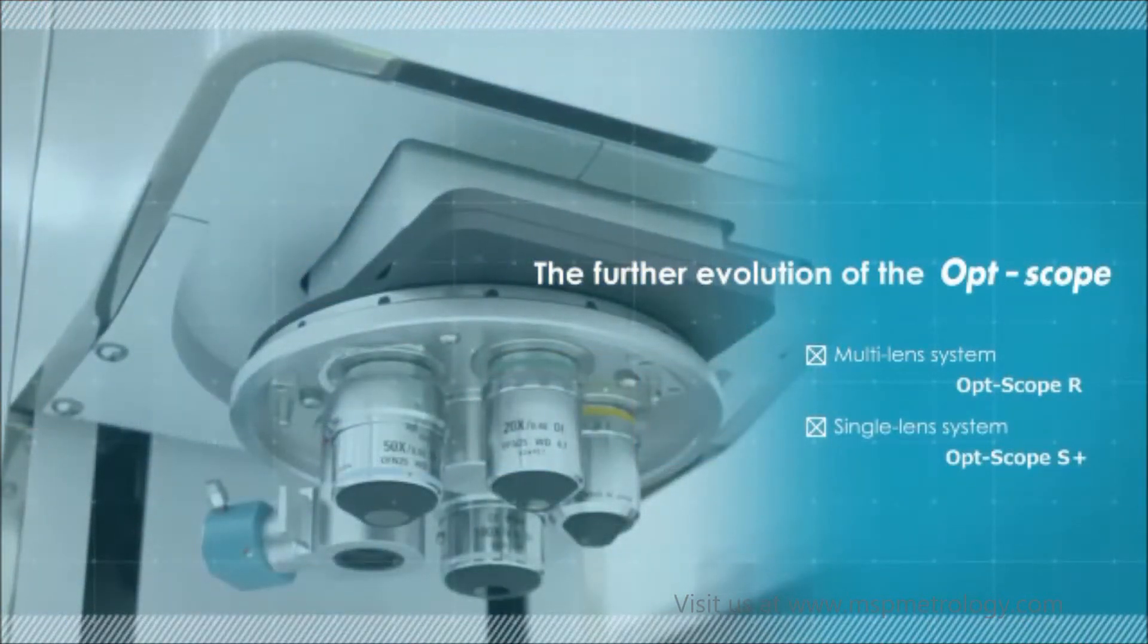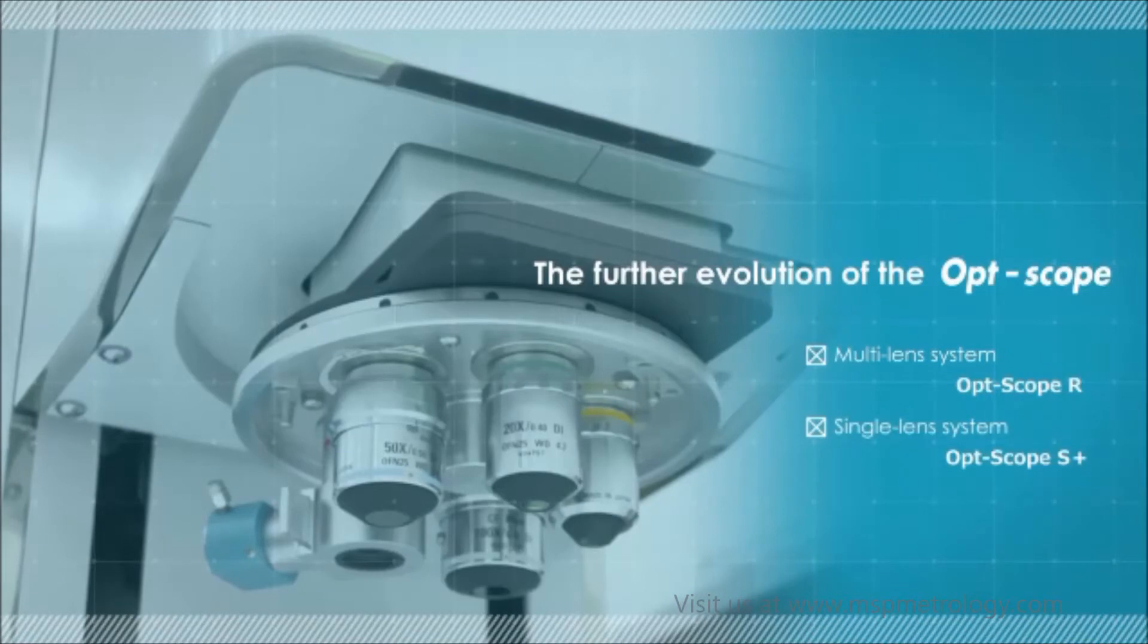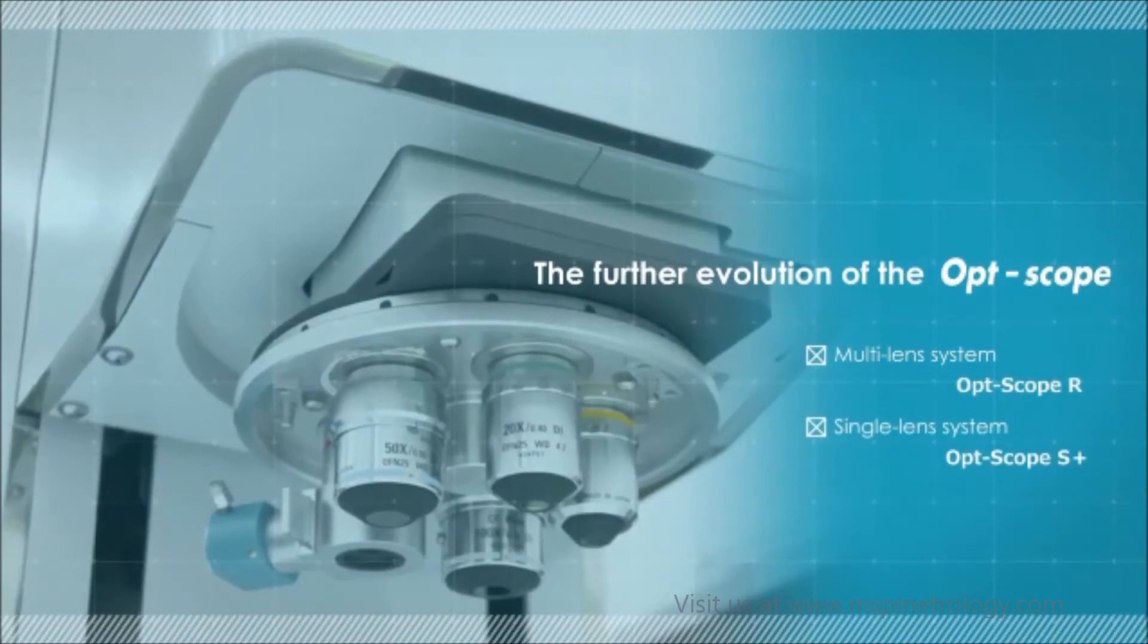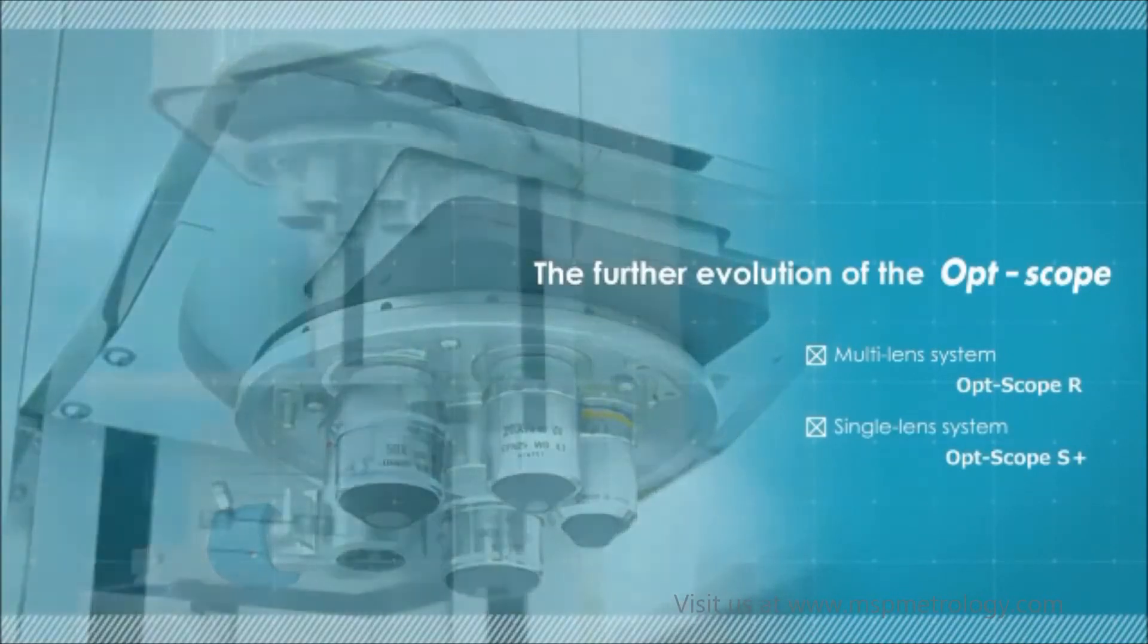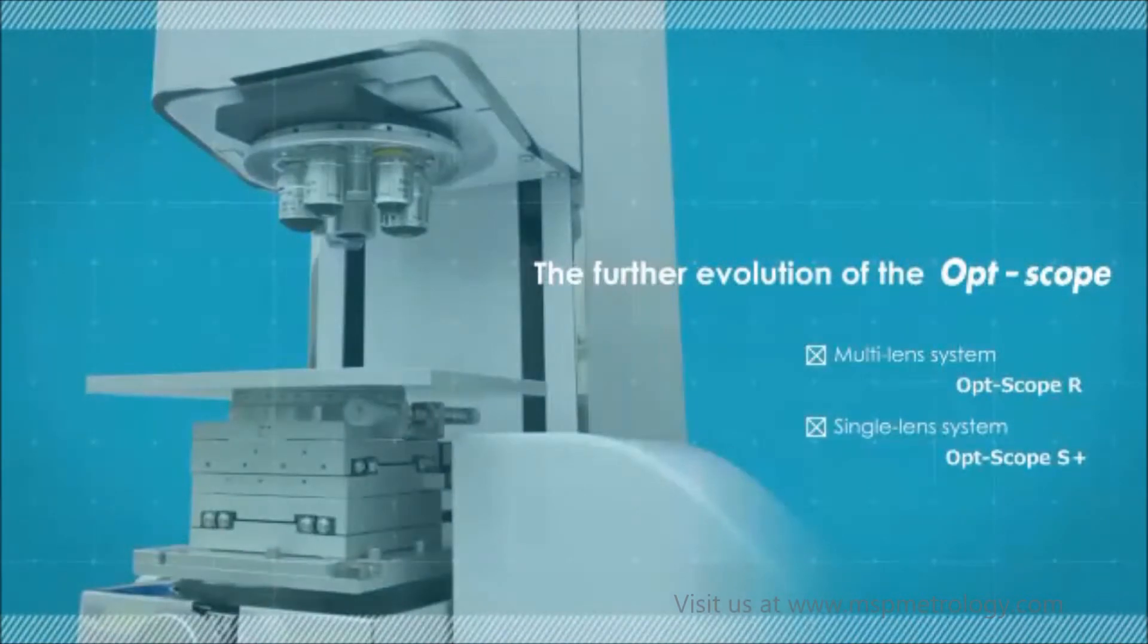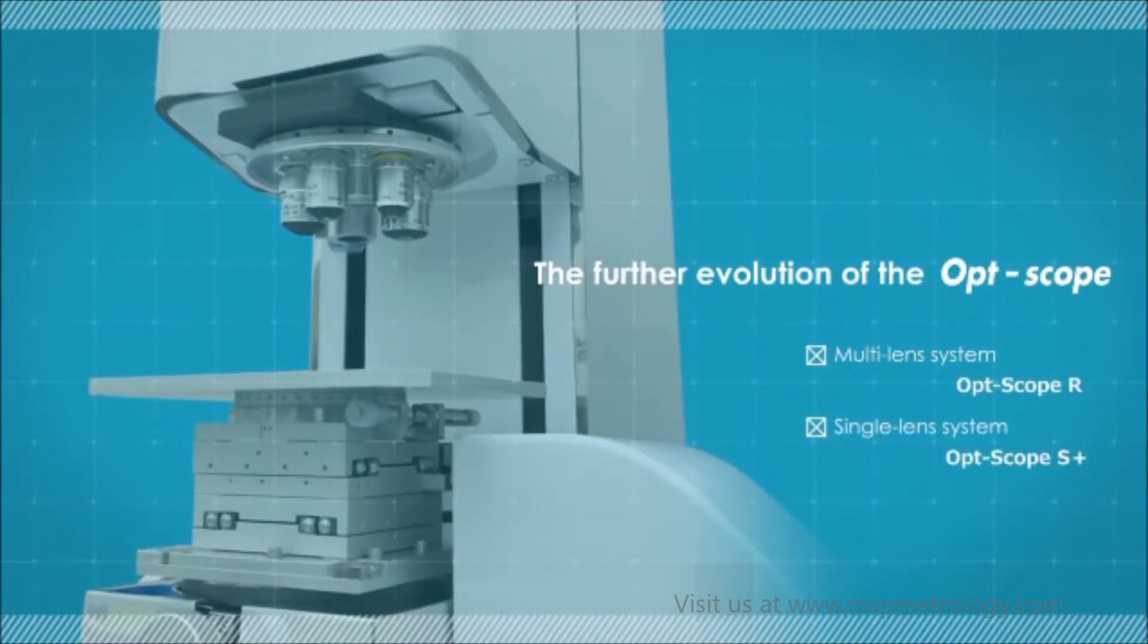These models have enhanced functions with a revolver mechanism and electric stage in a brand new design of the main body, integrated with the stand, adding to their ease of use. They certainly meet wide customer needs.